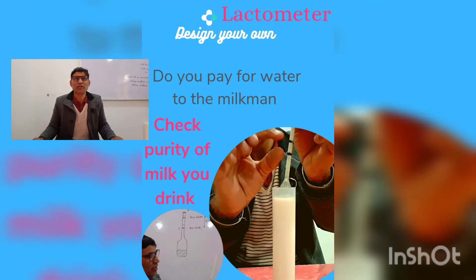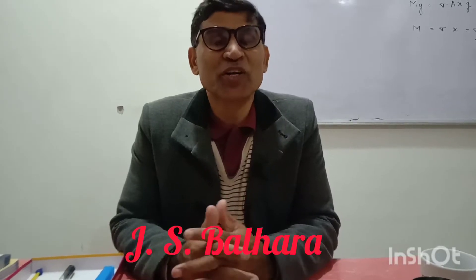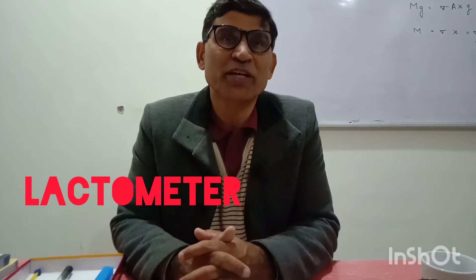Friends, you know milk is very important for our health, but do you get this milk direct from animals or through the milkman? Do you pay for water or pure milk to the milkman? To check the purity of that milk, we use a lactometer. So today we are going to learn how to use the lactometer and what is the physics behind it.